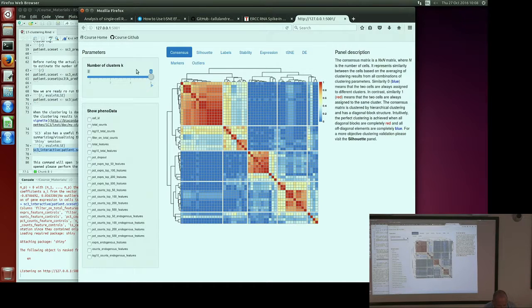So we thought that this interactive approach to visualizing this clustering solution in this manner is kind of useful. We find that it actually helps you to understand what k is good and whether you need to increase it or decrease it, and it's very helpful.